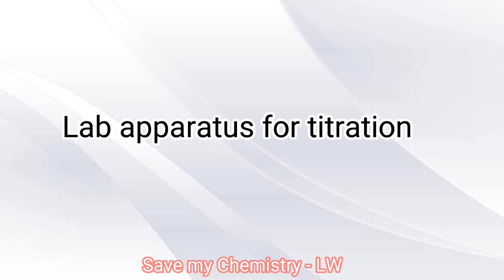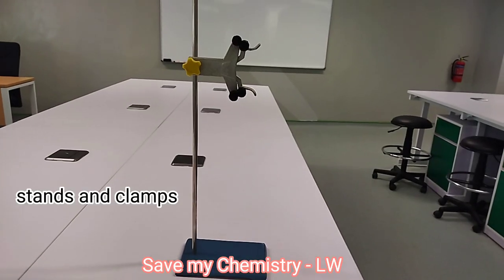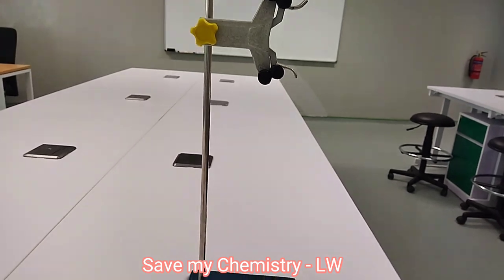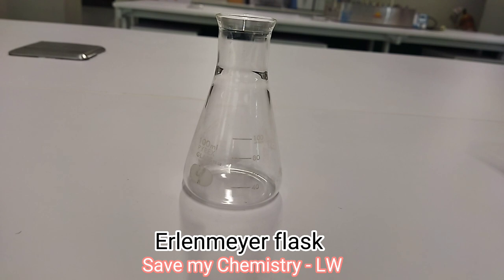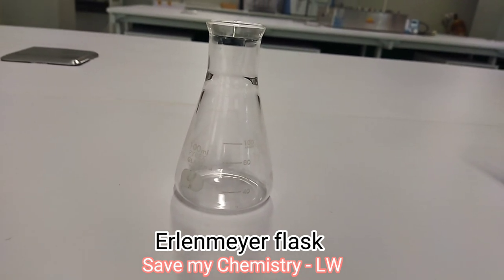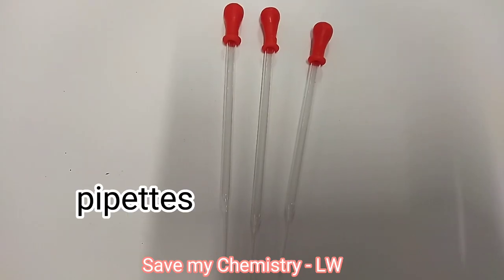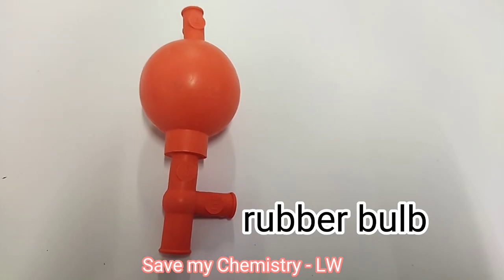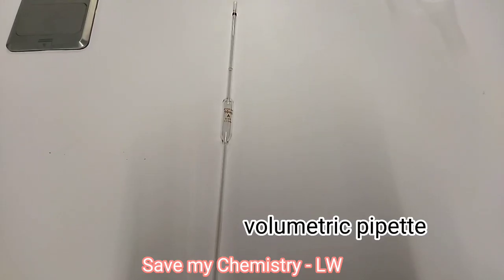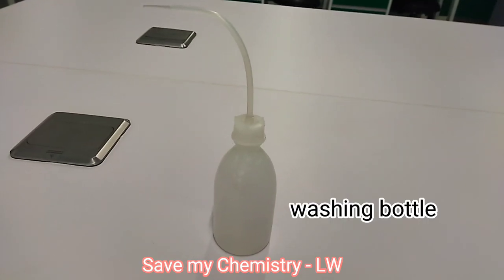The lab apparatus for titration: burette, stands and clamps, Erlenmeyer flask, beaker glass, pipettes, rubber bulb, volumetric pipette, and washing bottle.